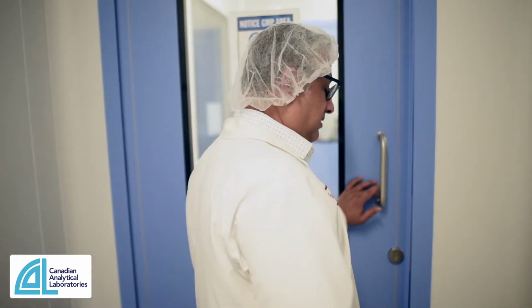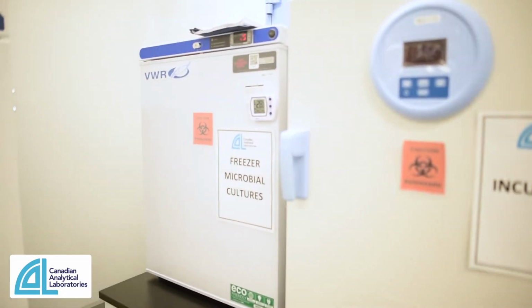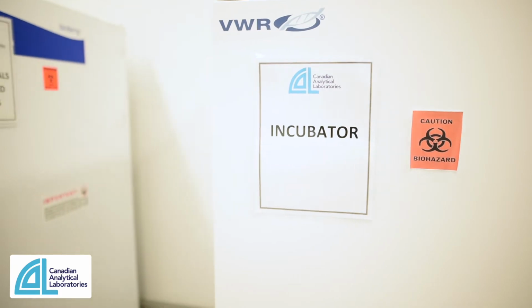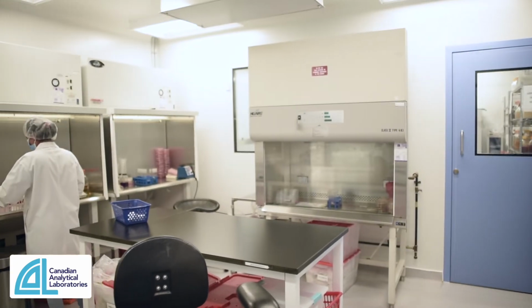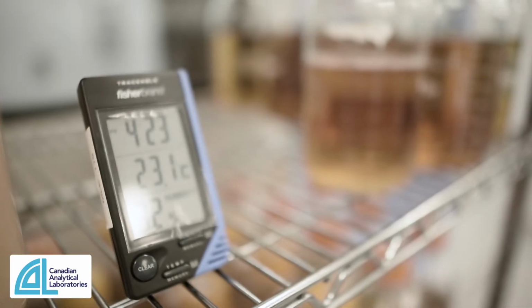So entering the Microlab. Microlab is access controlled to only microbiologists, and this is separated by an airlock and HEPA filters up above. In here, we keep all of our incubators and media storage outside of the actual microlab where the work's actually being performed. So in here, you'll see laminar flow hoods across the wall there, biological safety cabinet, and then through the other side, we have all of our media preparation.